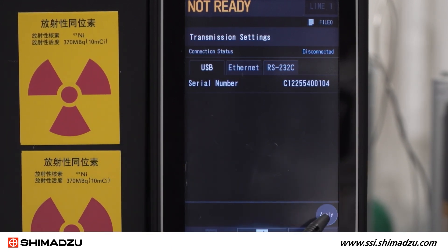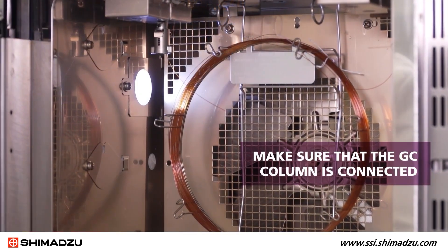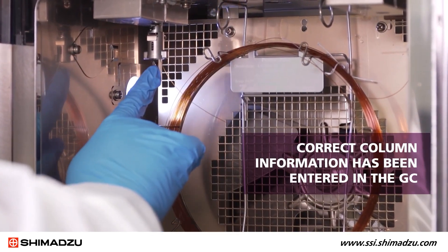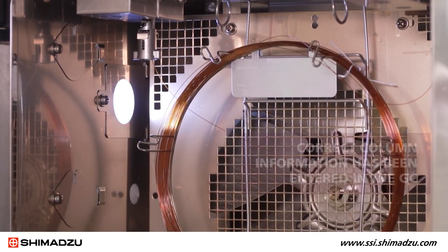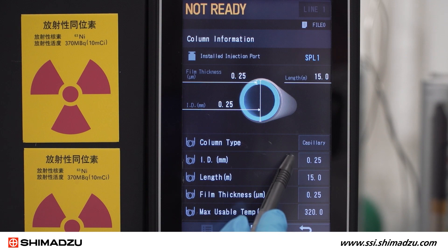Press Apply after entering any changes. Next, you must check to make sure that the GC column is connected and that the correct column information has been entered in the GC. You can access column information on the control panel by selecting Column Info on the Column Oven screen.